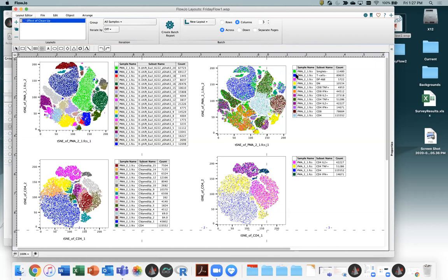Then this blue population, this one here, are my not T cells. So if the study was really just about how different T cell populations are affected by stimulation, this is a fairly large amount of the space that I can portray my data in being dedicated to cells that I'm going to immediately ignore. And so it might be worth focusing on a particular phenotype. Again, the clustering algorithm can find them, it separates them. It did a pretty nice job of that, in fact. But if my goal was just to take out and not care about things that weren't at least CD3 positive, then that was just kind of wasted space that hurts my ability to differentiate the rest of these populations, because they have to be compressed to represent this on our scale.